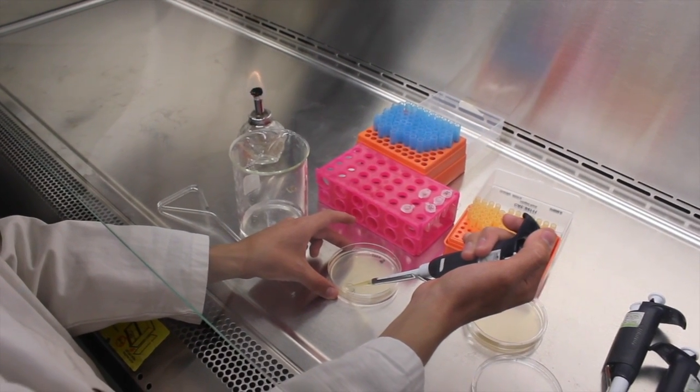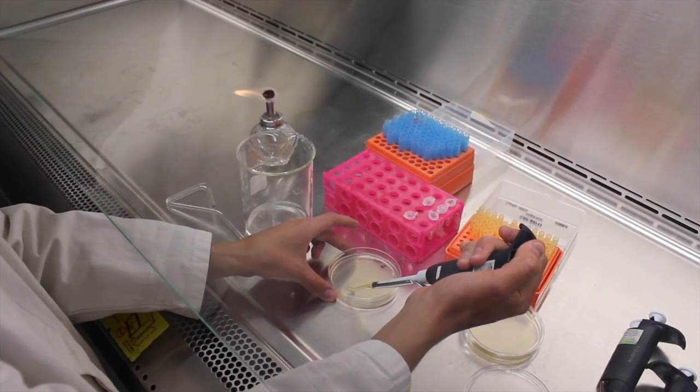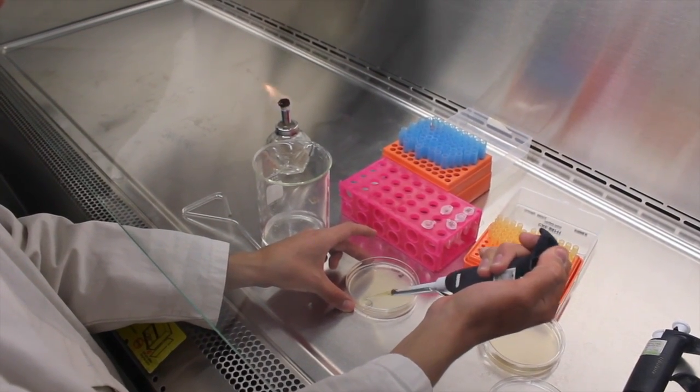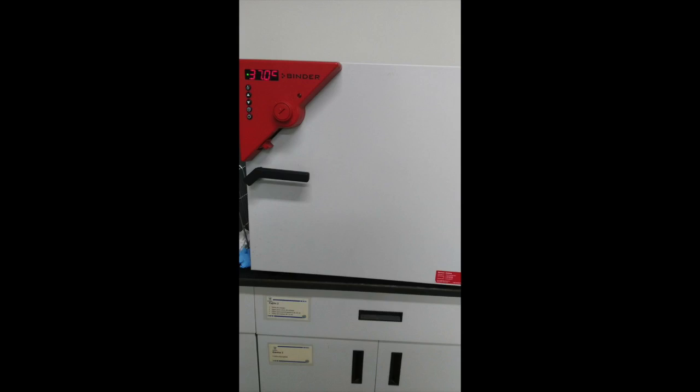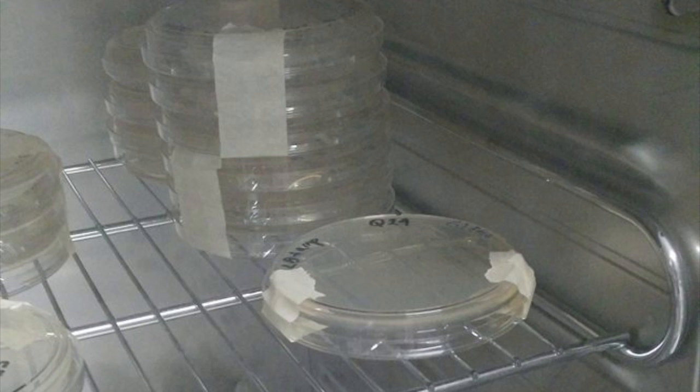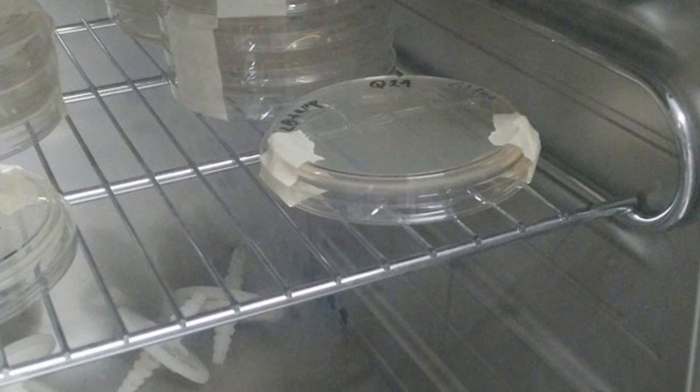The entire volume should be spread with a spatula on an LB plate with ampicillin at 100 micrograms per milliliter and X-gal. Incubate the plate overnight at 37 degrees. Once the results were registered, the plate must be kept in the refrigerator.